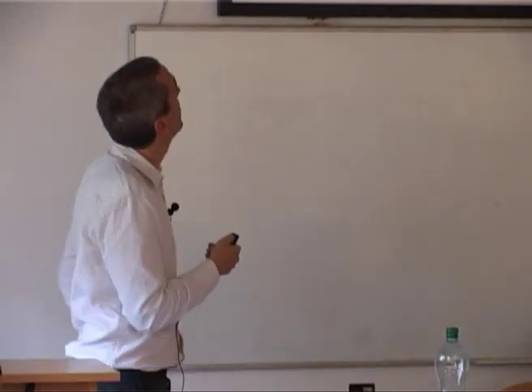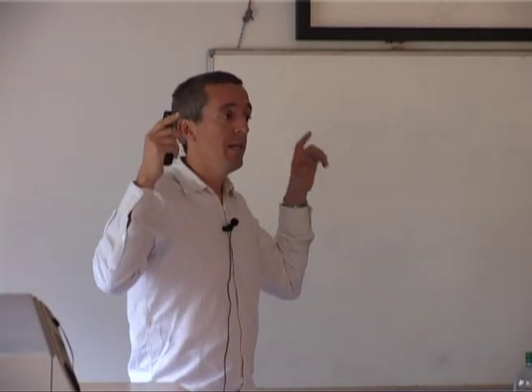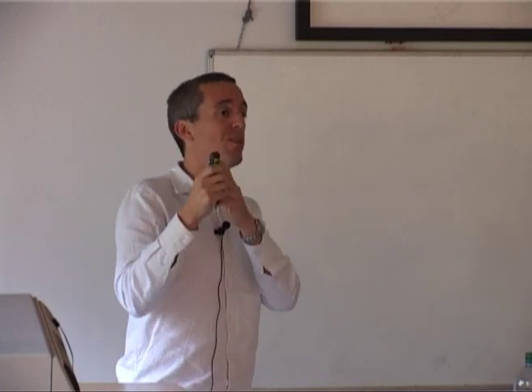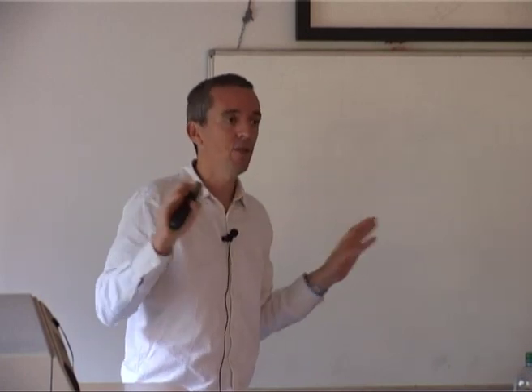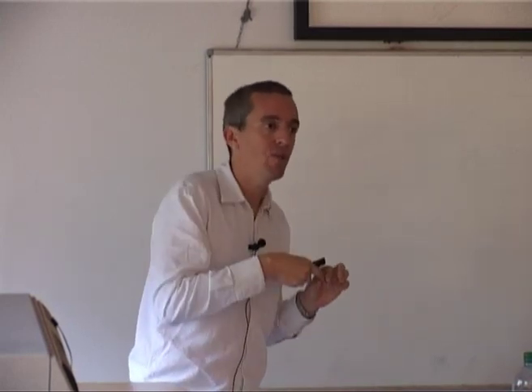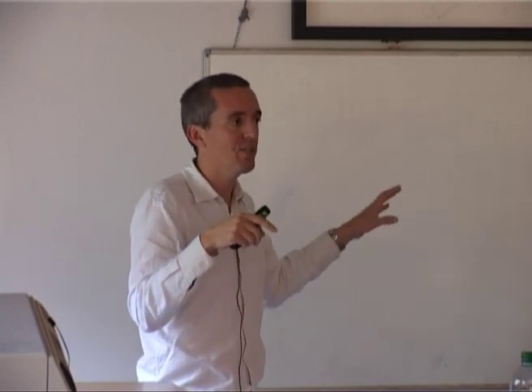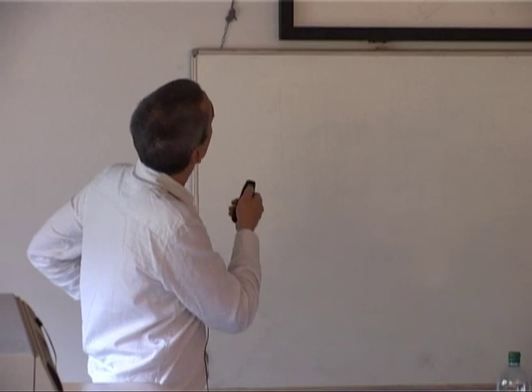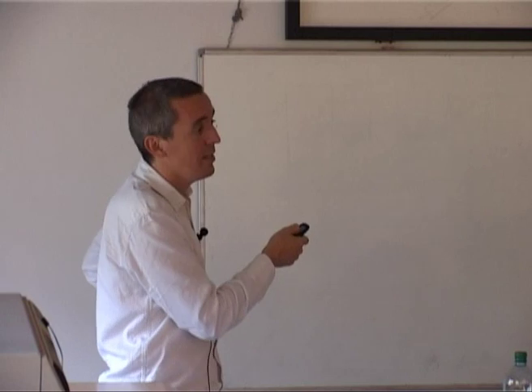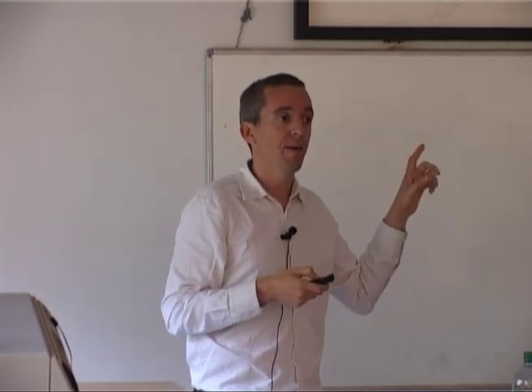Why is that important? First of all, remember, those stromatolites I've shown you on the shore are composed of hydromagnesite and aragonite only, no benstonite. Within these cyanobacteria, you have benstonite. That means the chemistry is completely different within the cells and outside the cells. So here we have a new case of intracellular biomineralization by bacteria. This adds up to the very few examples we have, which are the magnetotactic bacteria.